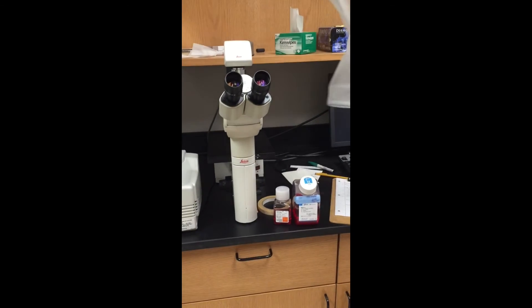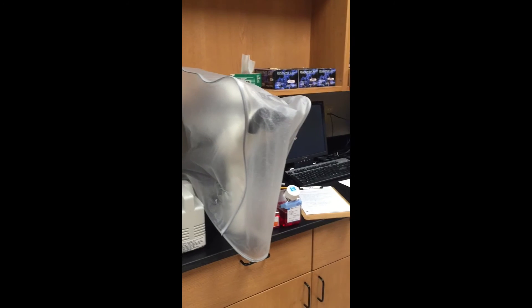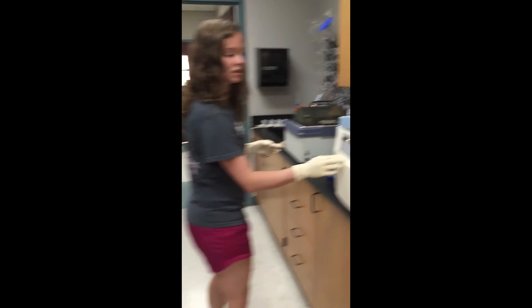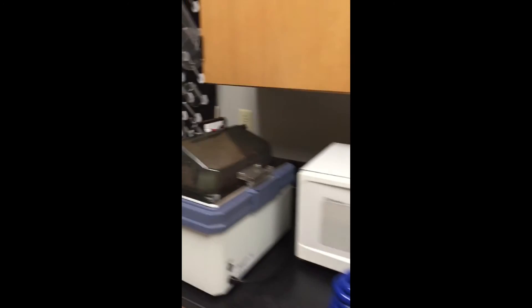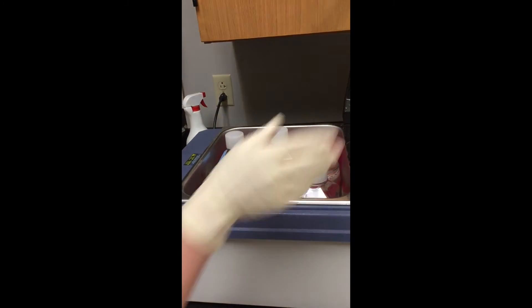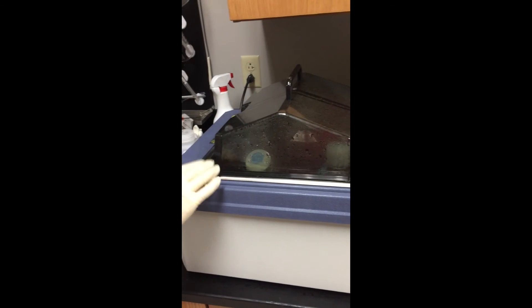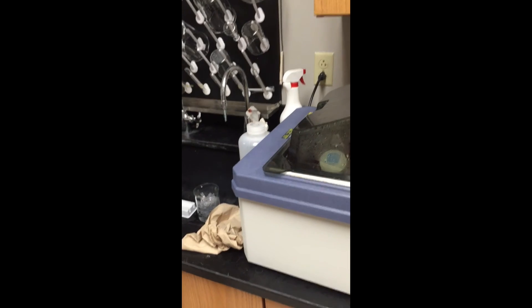Cover up the microscope with its cover and make sure the lamp is turned off. Make sure the centrifuge is off. And then last, check the water bath and make sure all the media and everything is gone. I'm not done working for the day so I still have some in there, but make sure that's empty as well. And if the water gets low in there, let someone know so we can refill it.